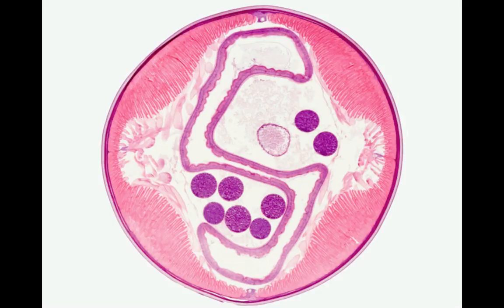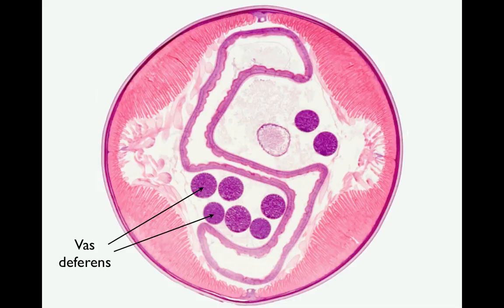Looking back at the cross-section of the male Ascaris, you can see eight different sections of the vas deferens. These vary somewhat in diameter, and if you look carefully, you can see that the cells within the tube increase in size as the tube becomes larger. Once the sperm have completed development, they are stored in a much larger section of tube called the seminal vesicle.